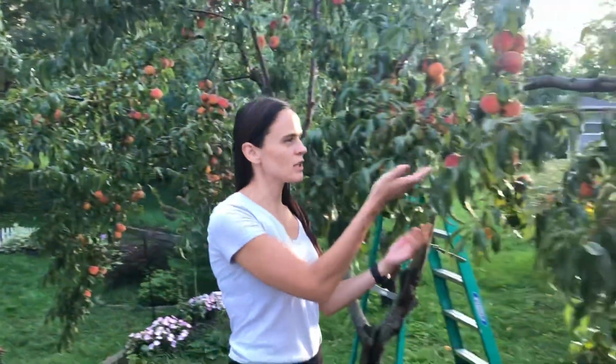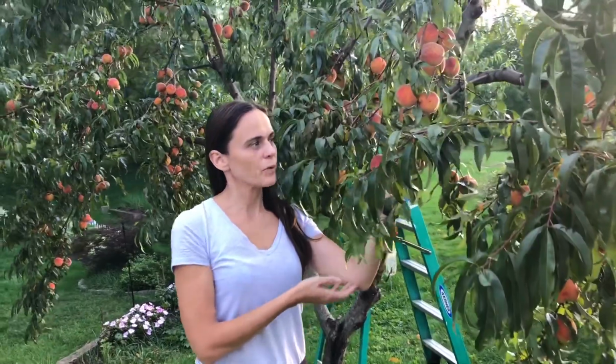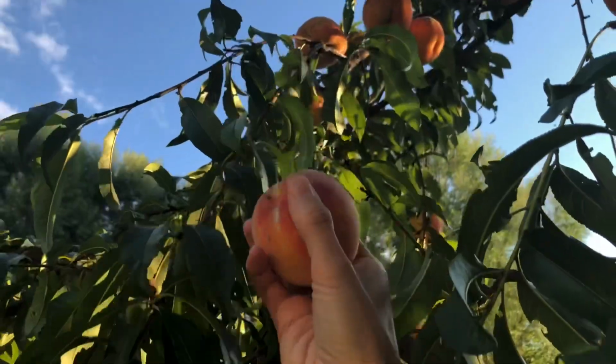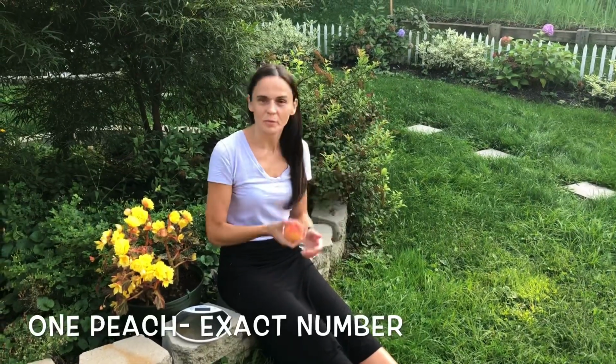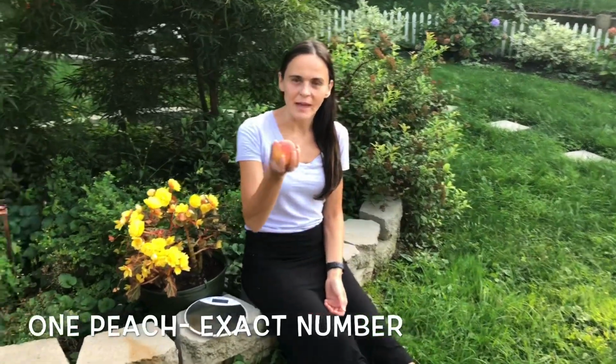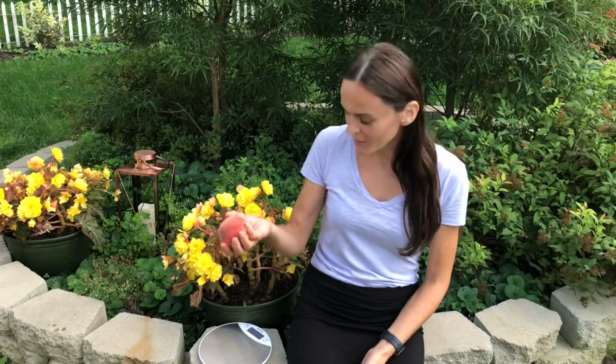So here we have a peach tree, and we can count the number of peaches on this tree or on a specific branch. Here I have one peach, which I just plucked from the tree, and it's an exact number because it was obtained by counting. Now let's see how much this peach weighs on a balance.